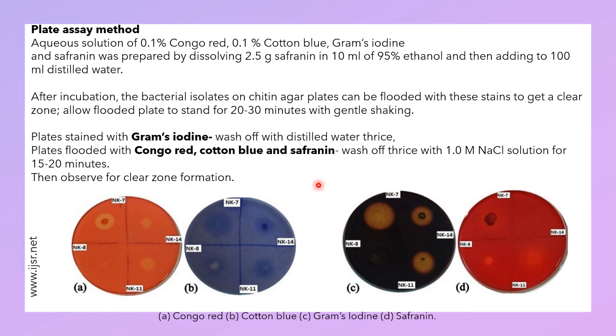Okay, so why is this required? Because it may happen that your stain is in excess on your plate, and there are some depositions on your medium. Okay, so you need to wash to remove those excess stains, correct? So after doing that, you can observe your plates.